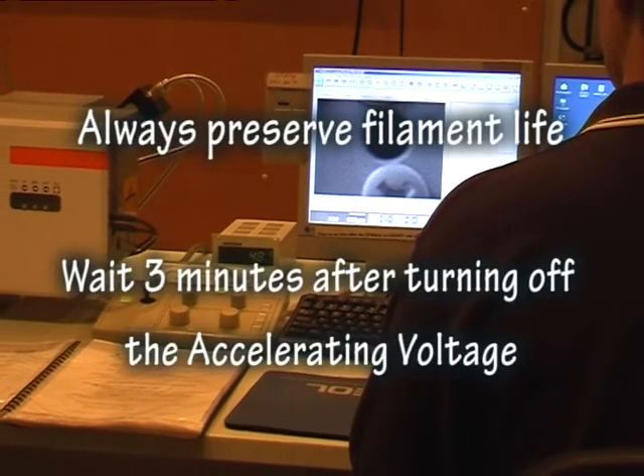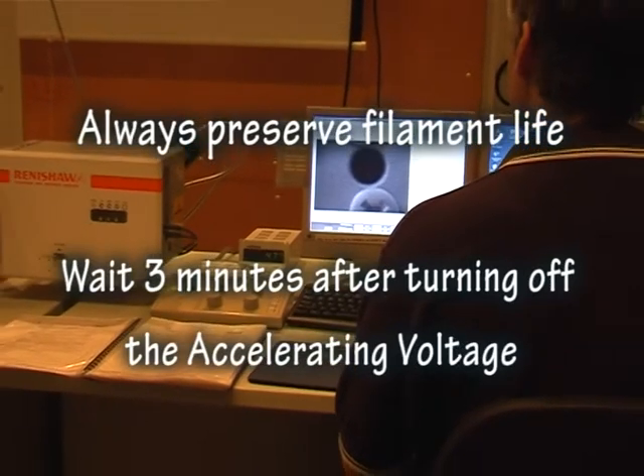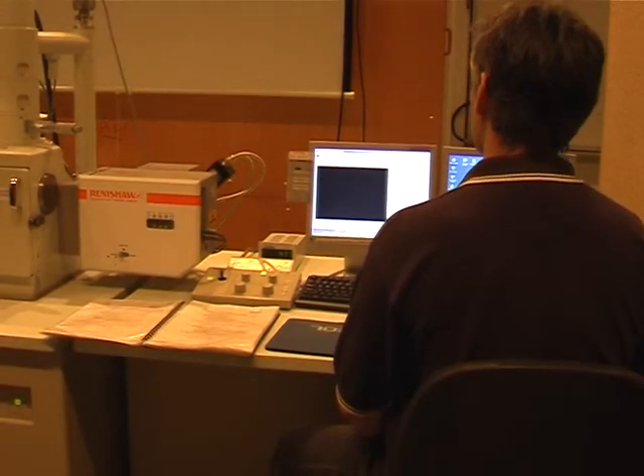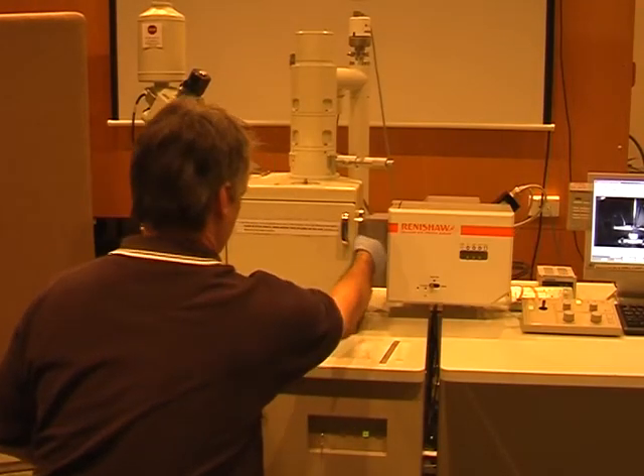At the end of your session, turn off your accelerating voltage. Wait another 3 minutes before proceeding. Vent the specimen chamber.